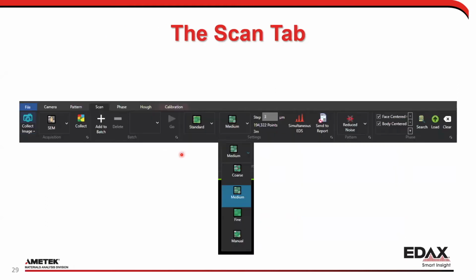Again, one of the major differences here is that this value is basically right in your face, right? So you're setting up an EBSD scan, you change your step size by a factor of 2, and this actually goes up by a factor of 4, right? So you can quickly go to very, very long map sizes before you realize it. And that basically lets you say, hey, maybe I don't want to do a 0.1 micron step size because the mapping is going to take me 12 hours. Okay, let's do 3 microns. This could be 3 minutes.